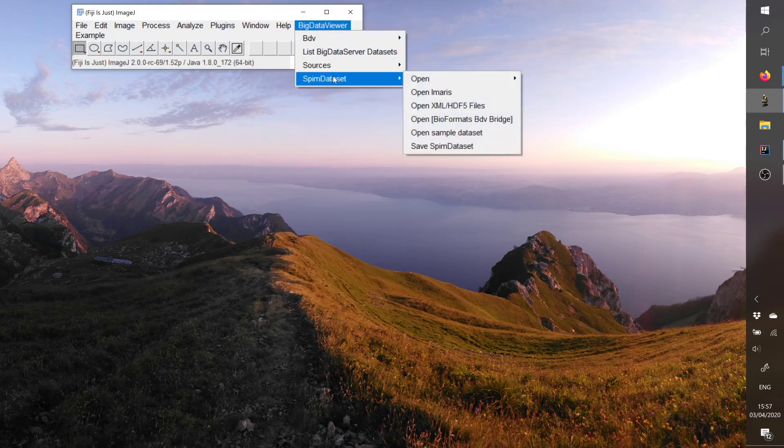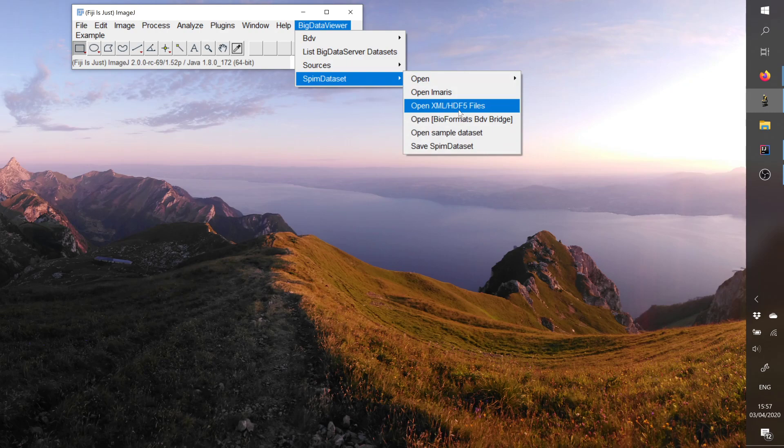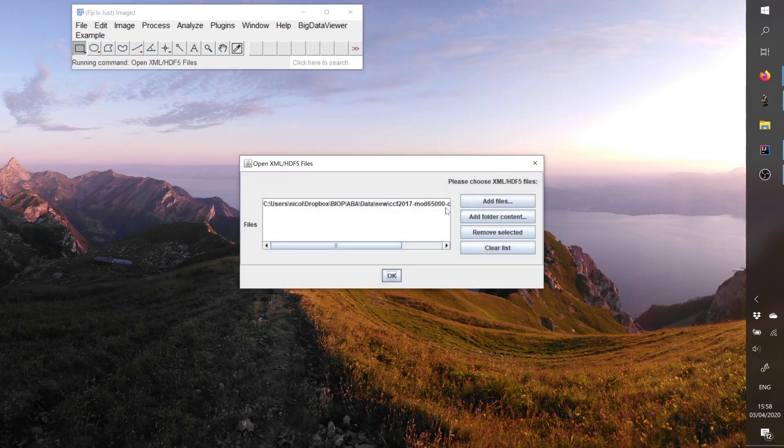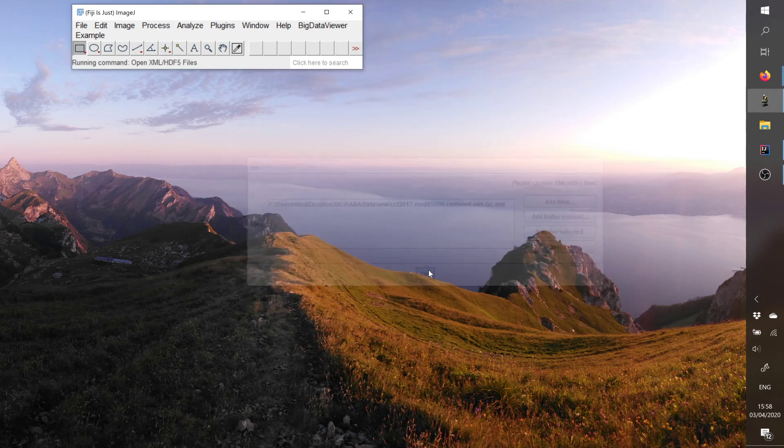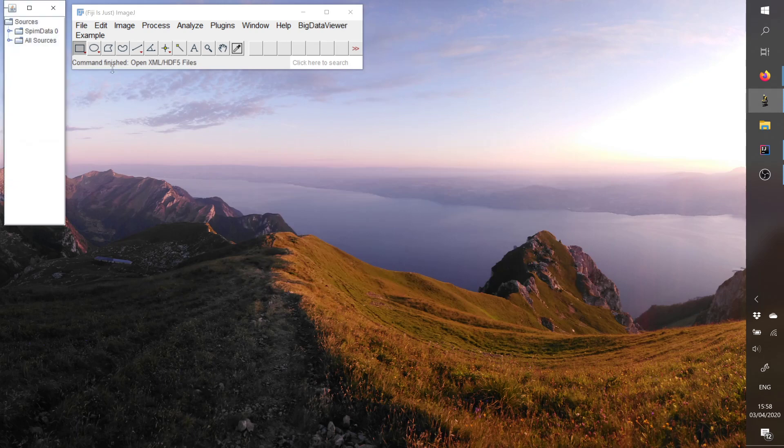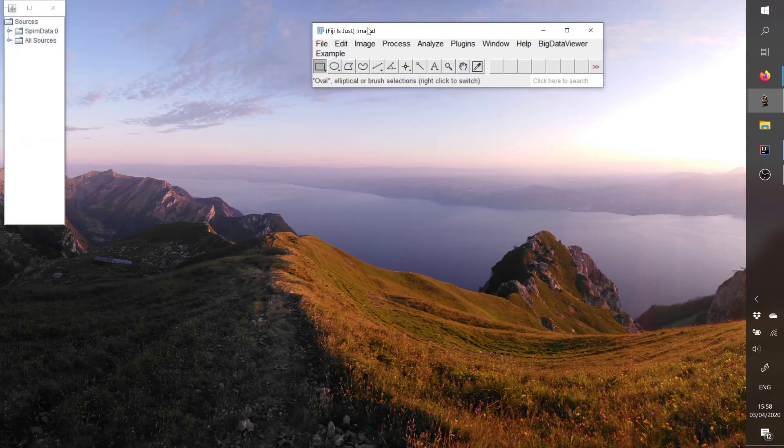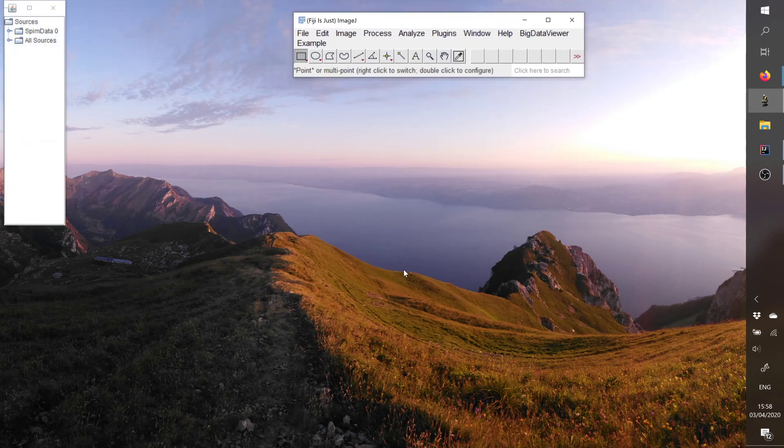these possibilities is to open several XML HDF5 datasets. You can find here in the menu, and here you can open one or several of these datasets. So if I press OK, the data is not appearing directly into Big Data Viewer but it's appearing here into a small navigator of the sources.